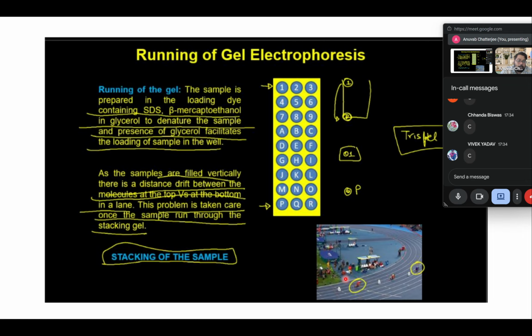The similar thing appears in Western blot. You do not want a big, huge protein to fall to the bottom of the gel first, and then when you start the gel, that flows very well, whereas your small protein is still floating at the top and has to travel all through the first part of the gel as well as the second part of the gel.